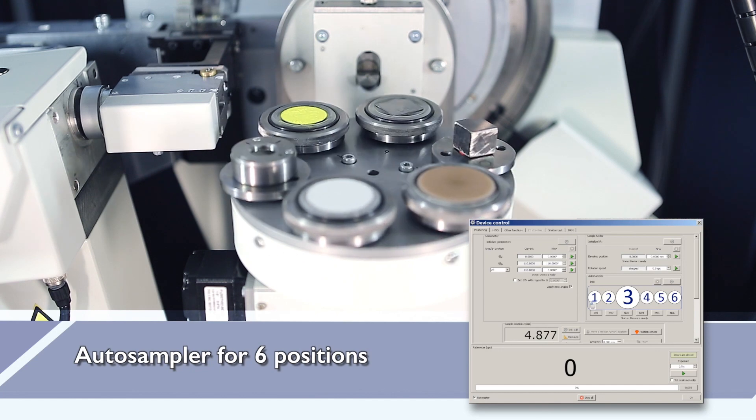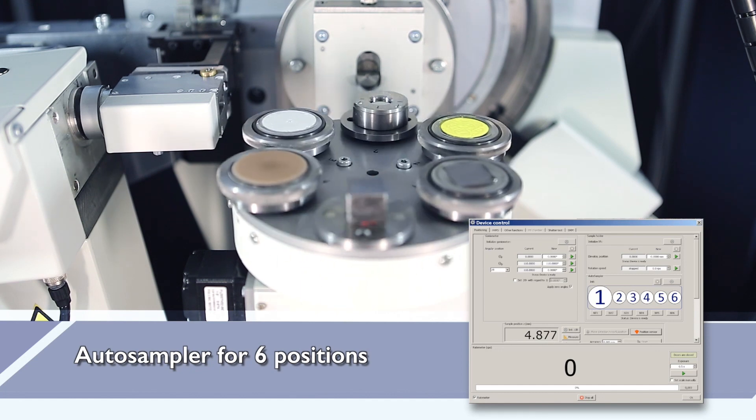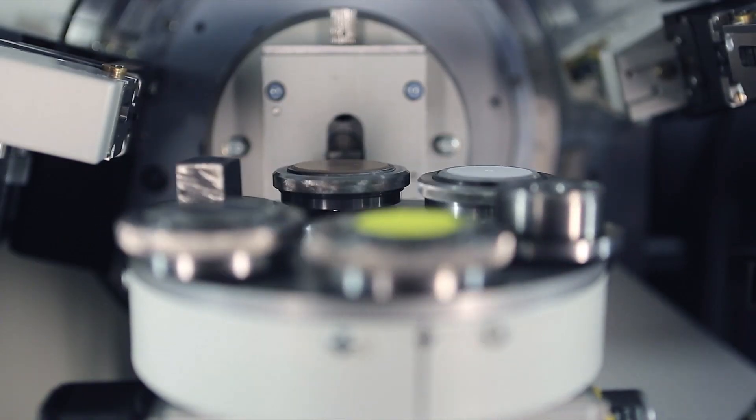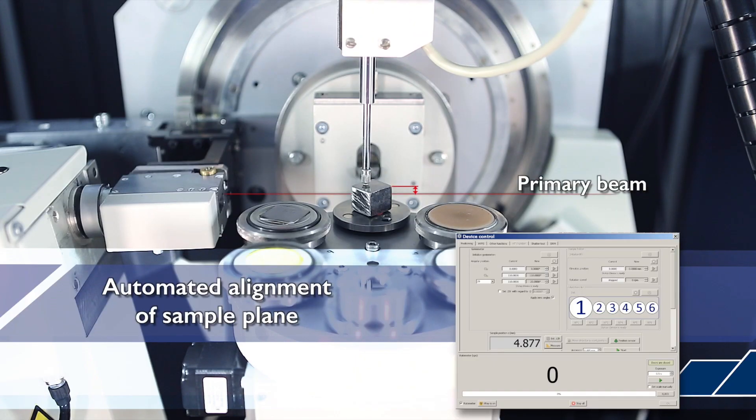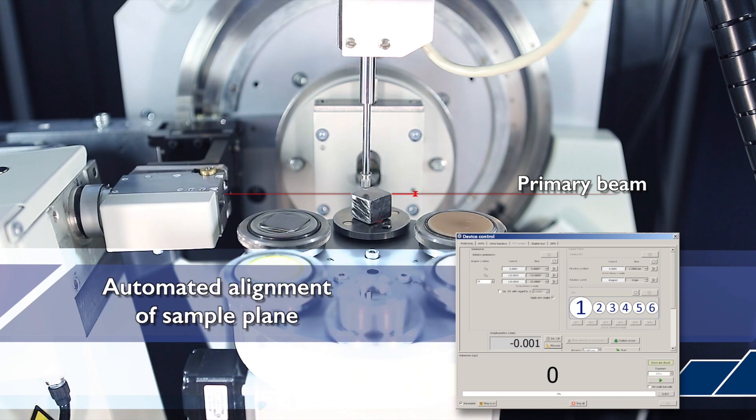With the auto-sampler, data collection from a number of powder or bulk samples is significantly simplified, owing to the software options of sample choice and alignment before starting each measurement.